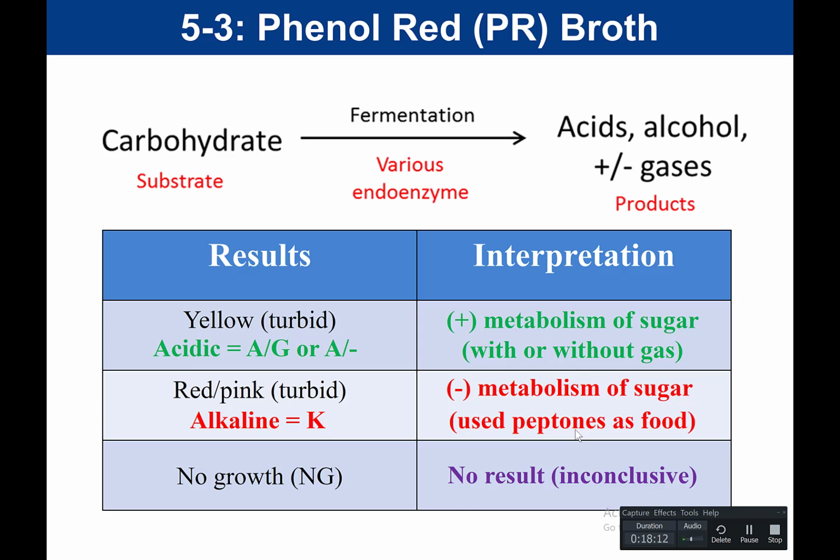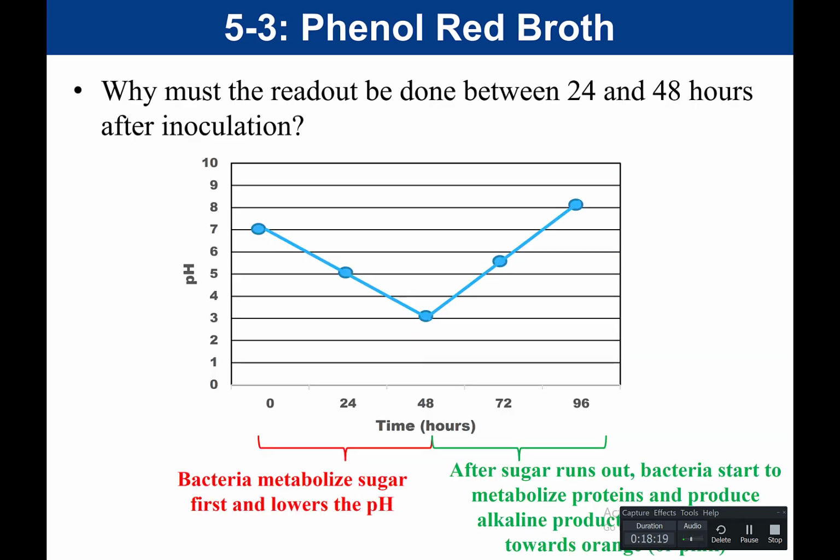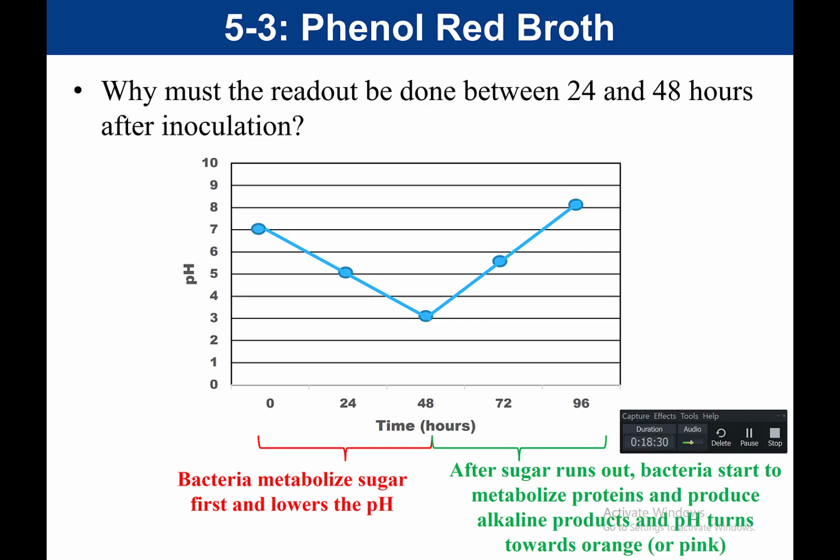And so this slide is really important in terms of your understanding. You want to understand why your readout needs to be done between 24 and 48 hours. That's an important part. The reason is that when bacteria are given the choice between metabolizing proteins or sugars, if they can metabolize the sugar, it is going to be their preferred food source. That's what they're going to use first for food.